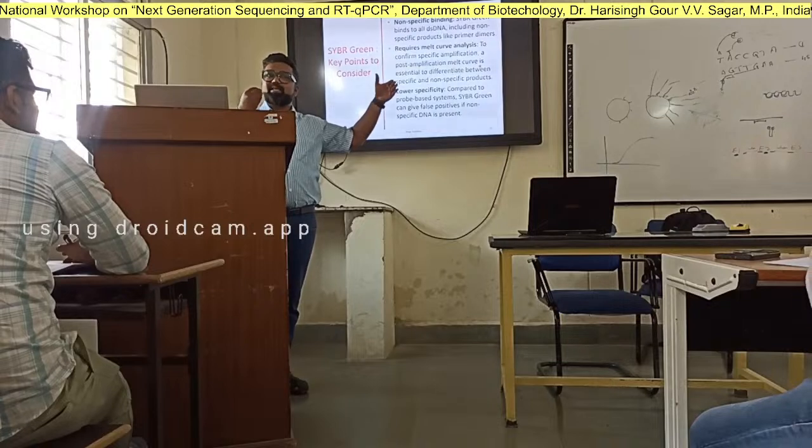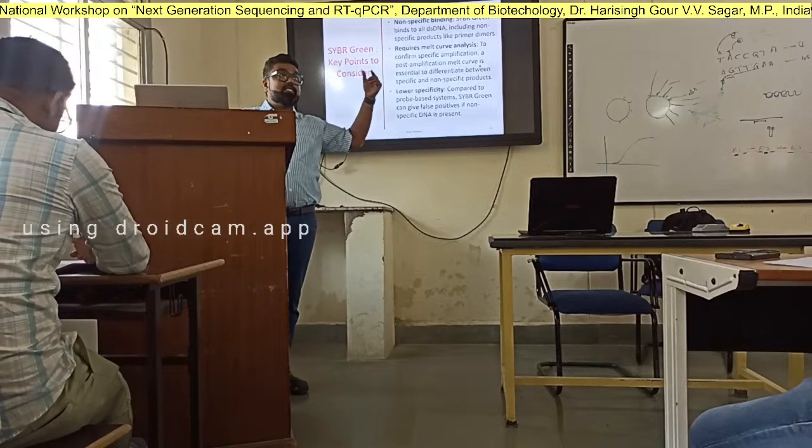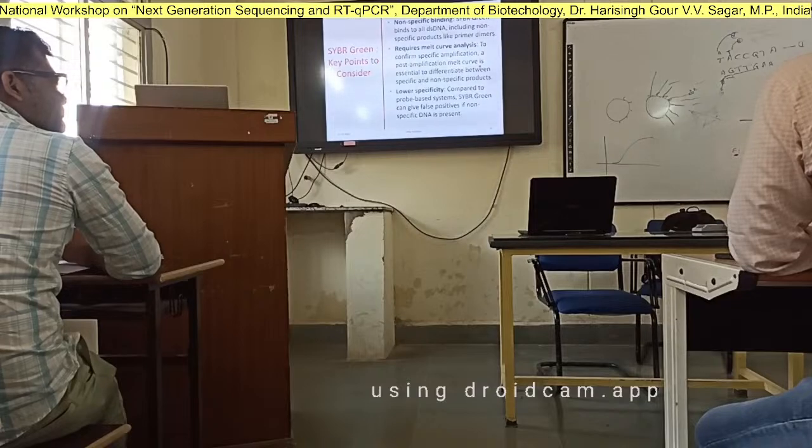Even if there is contamination, how do you know? Then you do the melt curve analysis.